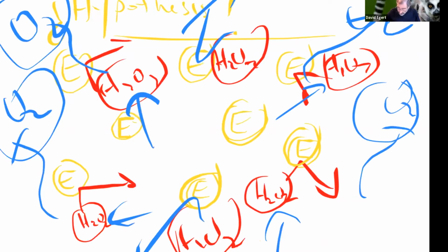Now, the other thing that she was just talking about is this idea of saturation. We have a limited number of enzymes. Like I said, there's a constant number of enzymes that we're using for every run.